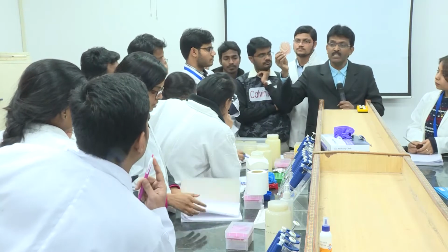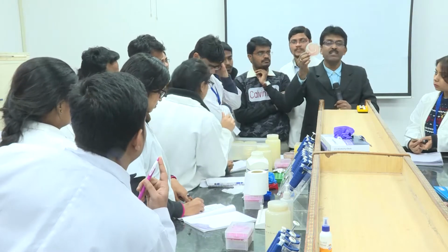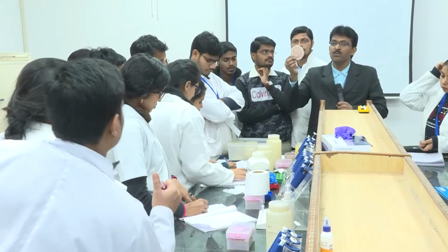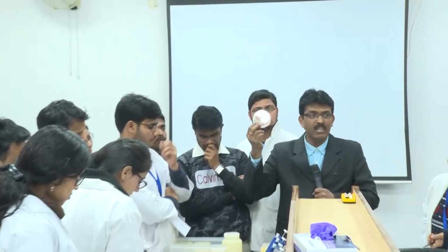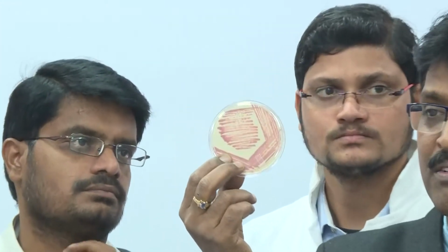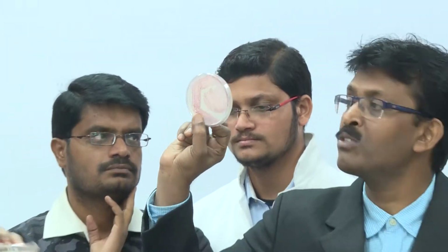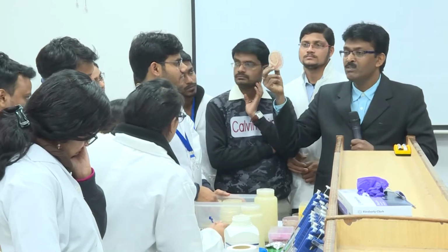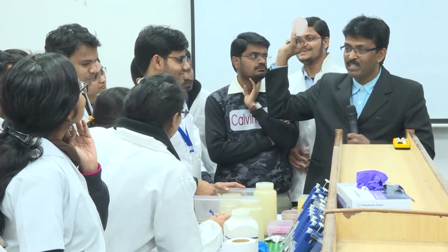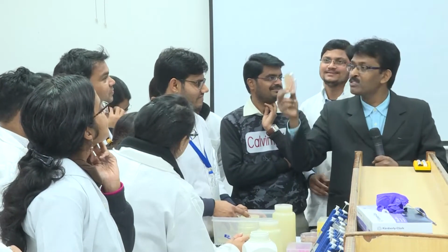This is a very simple technique to characterize the bacteria morphologically, because every bacteria looks different. So we use this just to differentiate the bacterial colonies. It's a very useful tool for morphotyping, right? Otherwise most of the colonies look alike on the plate, so we decorate the bacteria by adding this chemical. Otherwise by default Pseudomonas fluorescens is not red in color. Don't carry the message like that. We artificially do some makeup for bacteria. So bacteria look beautiful now, isn't it? You can also do this, right?